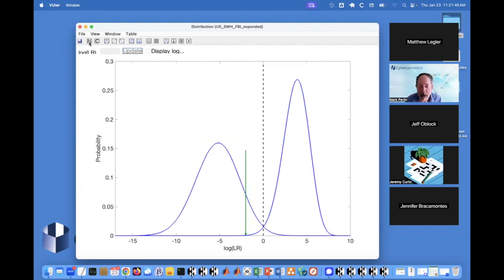Turning on the contributor curve, you can leave the other one on, and you see the two of them together. And there's enough resolution here that we're seeing that Robinson's match statistic, the green arrow, is separated from the curve on the right, the contributor distribution. He doesn't look like he's a contributor. Now turn off the non-contributor. And the question is, by how much?